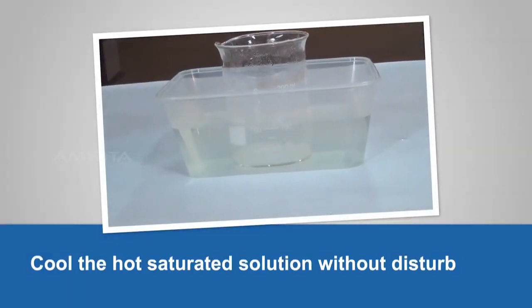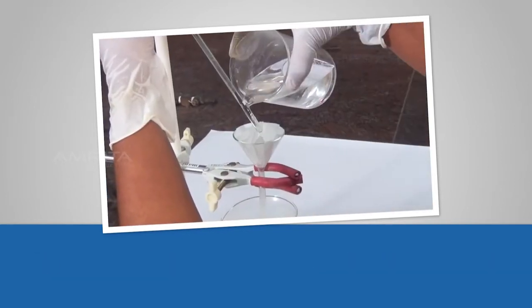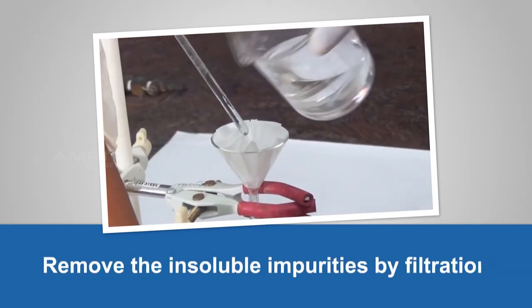Precautions: cool the hot saturated solution without disturbing it. Remove the insoluble impurities by filtration.